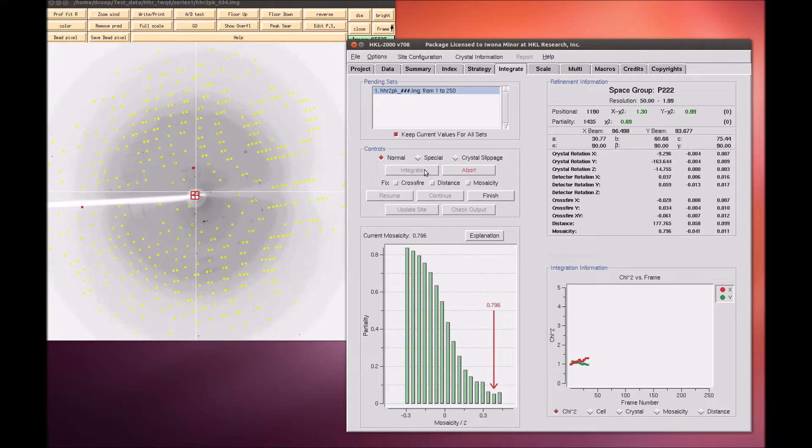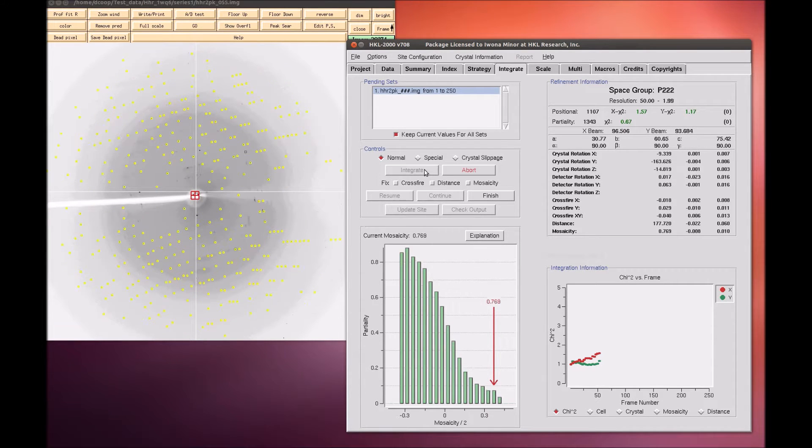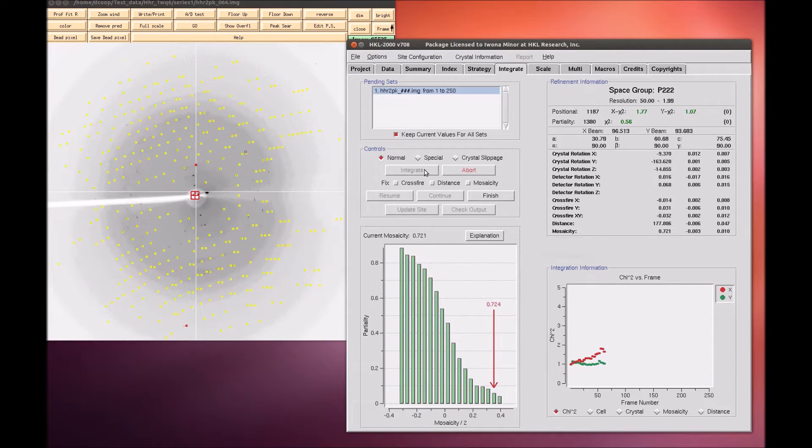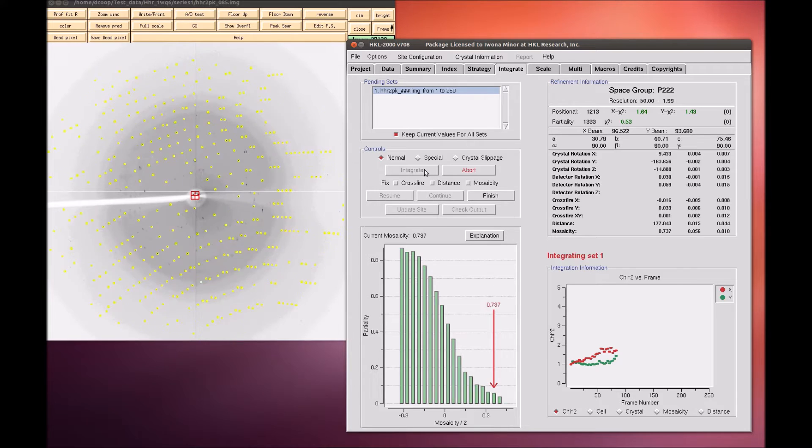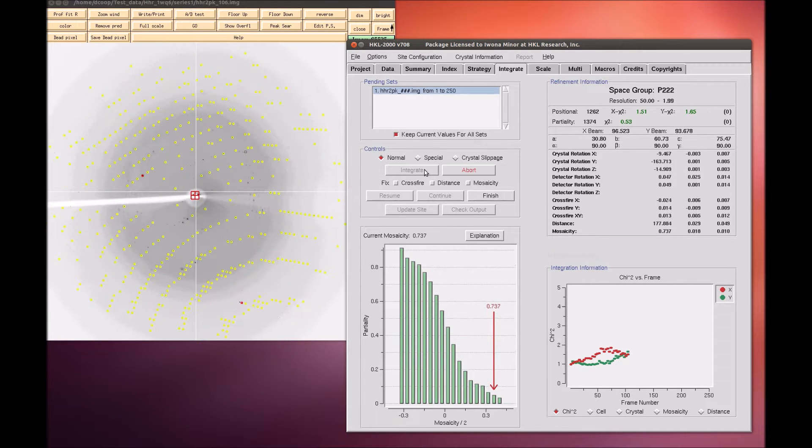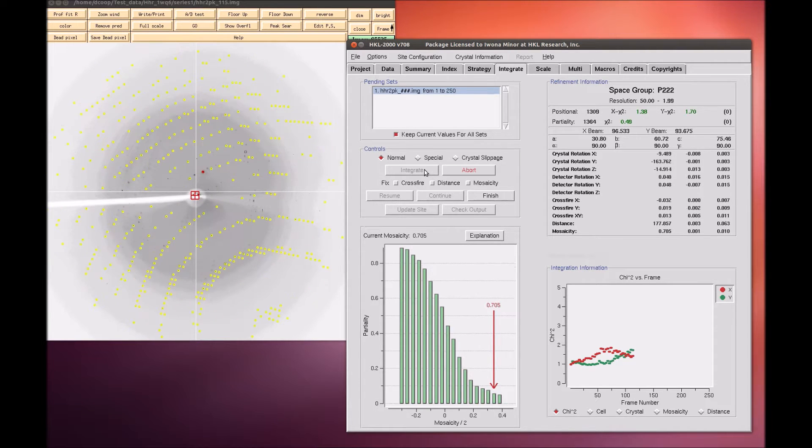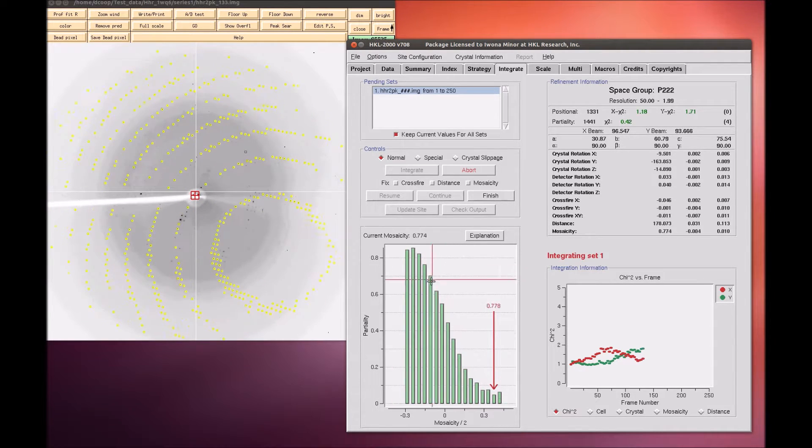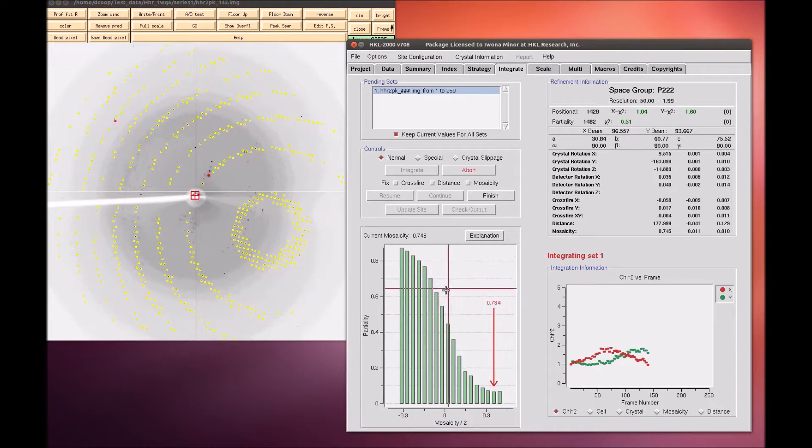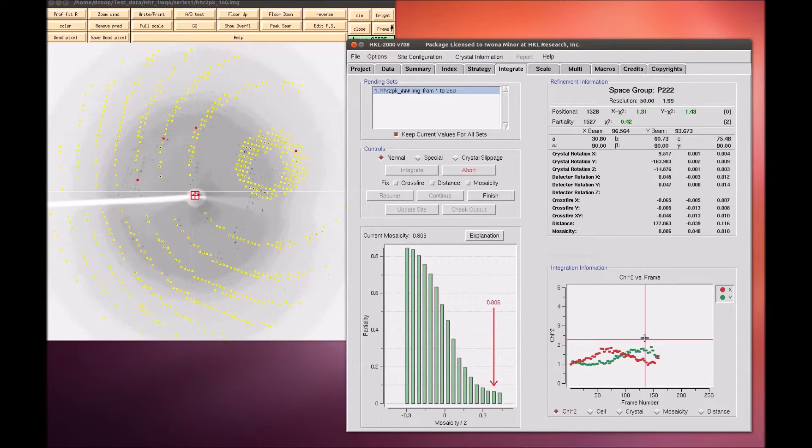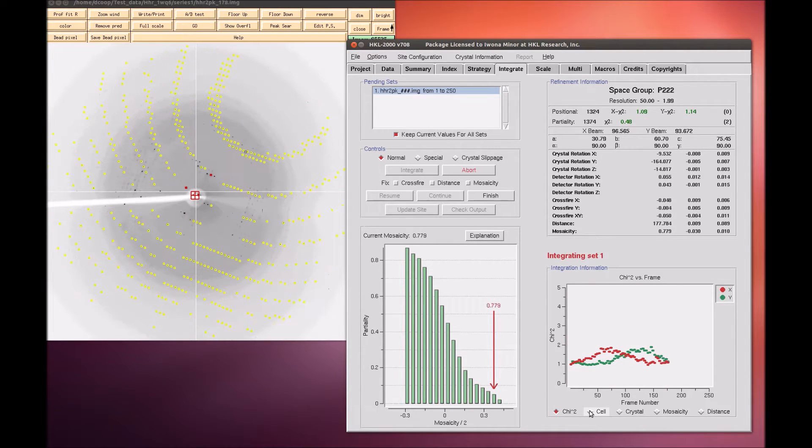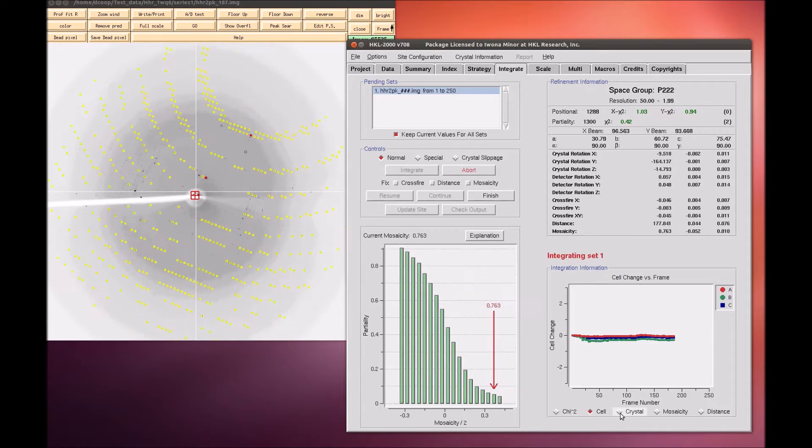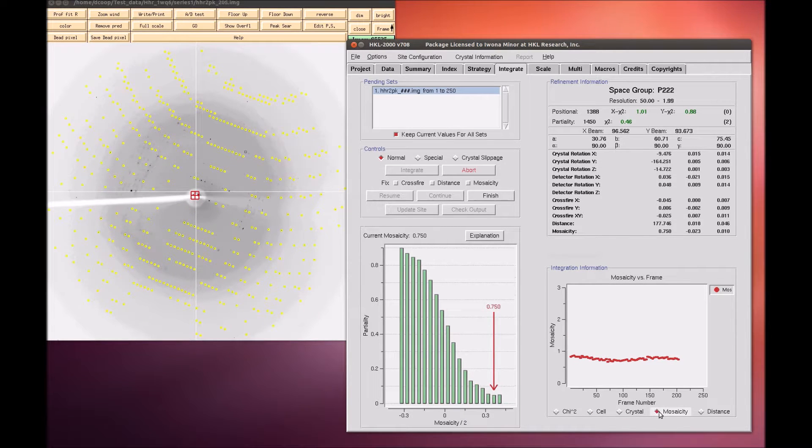HKL will work through all of the available images. The image will be displayed. Peaks will be predicted and then refined for each image. The display will show a mosaicity histogram for the image being indexed and a cumulative graph on the right. The buttons on the bottom let you examine various parameters.